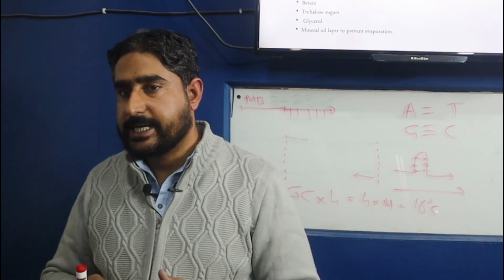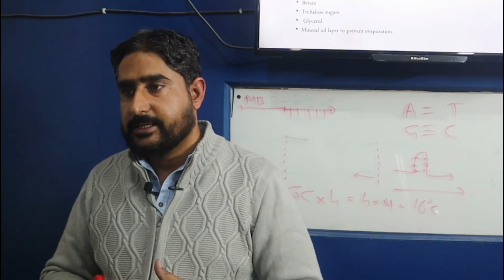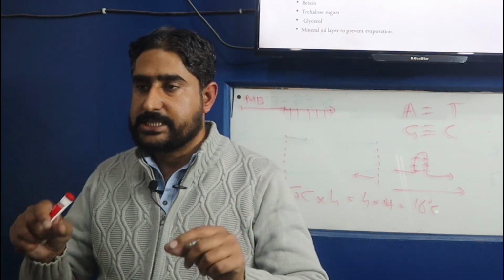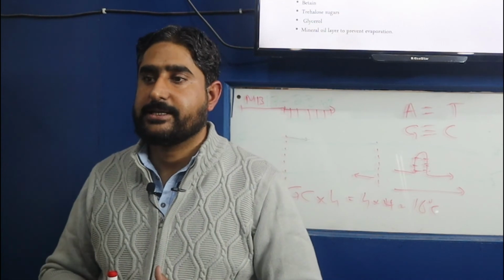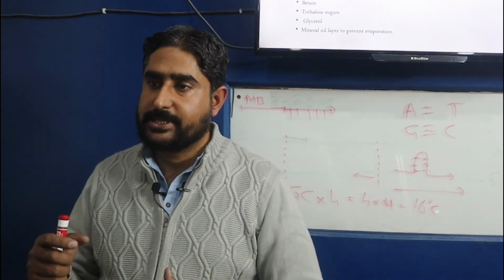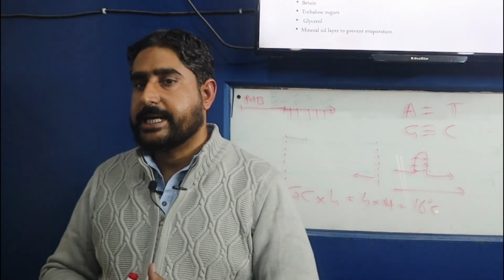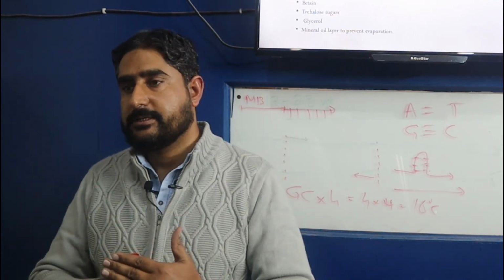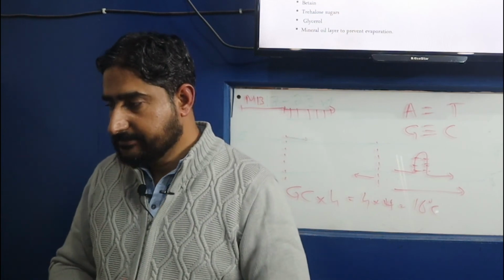The other thing that can be important is that your primer is trying to anneal to regions which have high G plus C content. That's another reason, because as I told earlier, high G plus C regions are complex or complicated regions which are not easy to amplify.